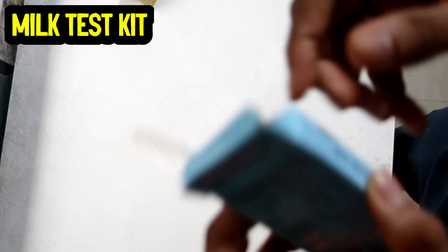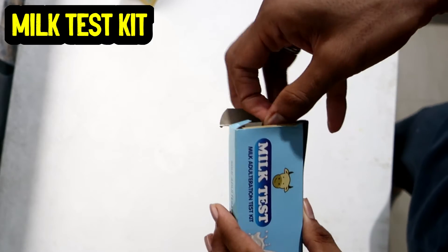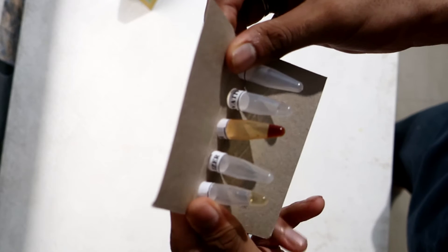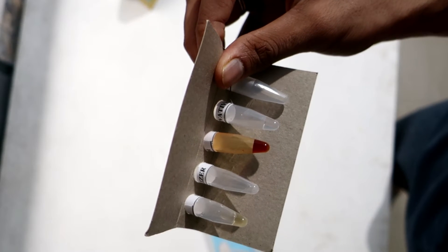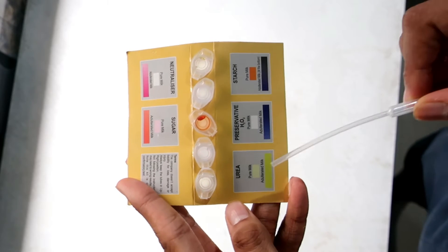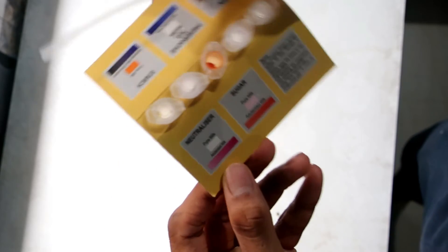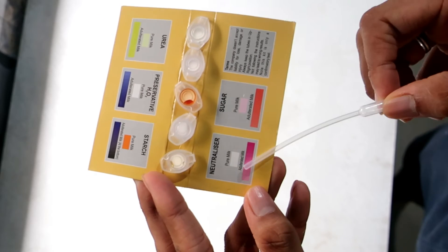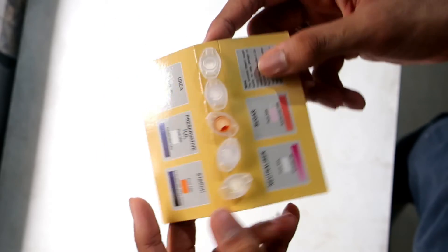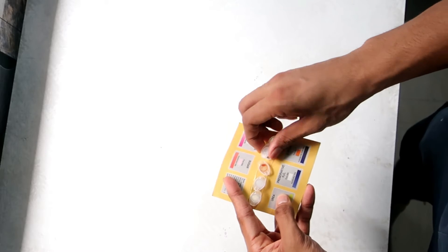This milk testing kit consists of five different chemical solutions which will help identify adulterants present in the milk, whether it is sugar, neutralizers, urea, preservatives, or starch. These adulterated milks might look superior but in reality can be very harmful for our health. The procedure is simple: pour five to six drops of milk into the tubes and shake well for two to three minutes, then check the color of the output solution. If it matches the pure milk color given on the packet, the milk is pure; if it matches the adulterated color, the milk is adulterated. Now let's see how the test goes.